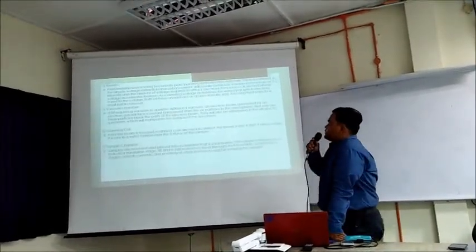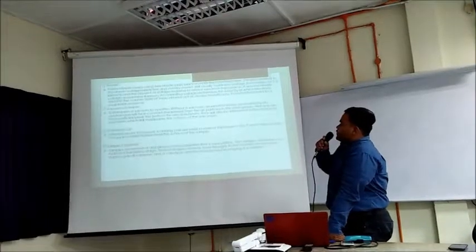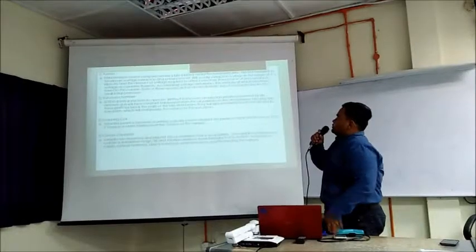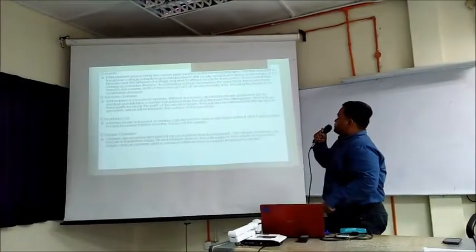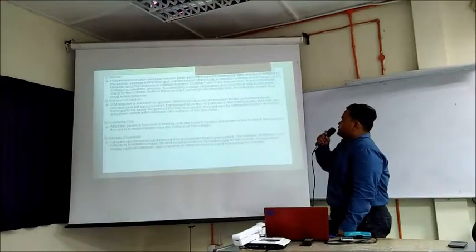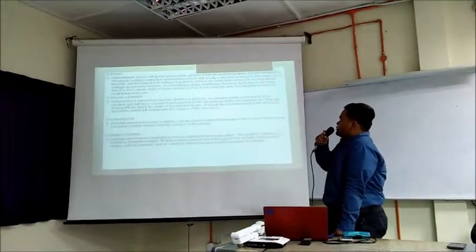Okay, number 6, anode. A field emission source uses two anode plates placed under the mounting arms. The first is related to the anode voltage extraction and enhancement.